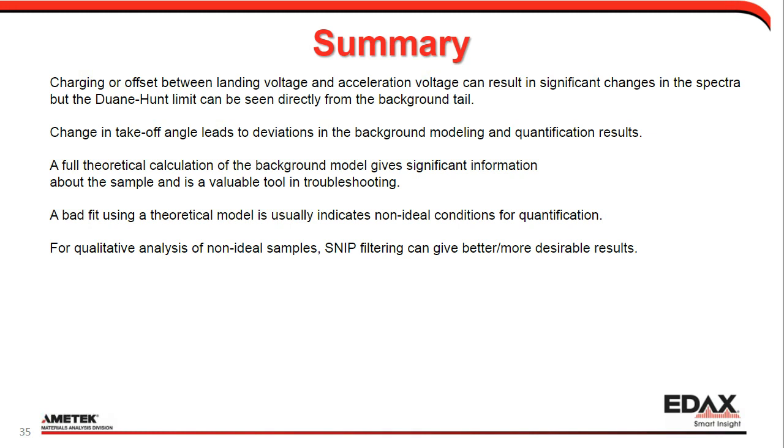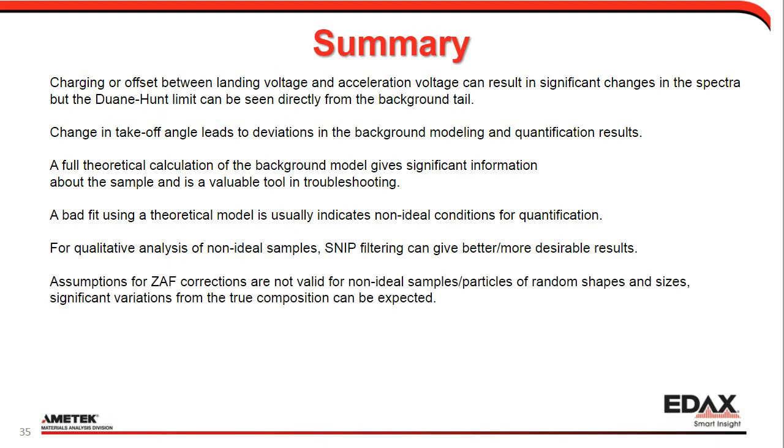For any of the tricky samples, particles, fracture surfaces, things like that, you have to be aware that the quant assumptions are not valid, which means you can get significant variations from the true composition. It may or may not matter. That depends on what your actual goals are, but be aware that in general, any particle, you will not get good quantification.